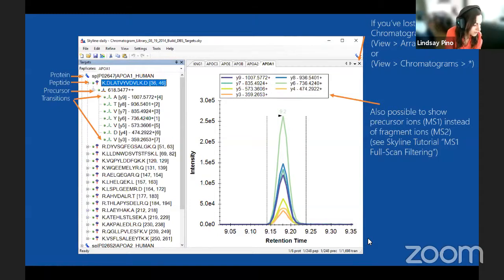Oh my gosh, so many questions now. Why are peptides normally doubly charged? They're not normally. +2s and +3s are most common for bottom-up mass spectrometry proteomics. However, there are a lot of other circumstances where a +2 or a +3 is not most common. For example, in phosphoproteomics, things like +3 and +4 are more common.